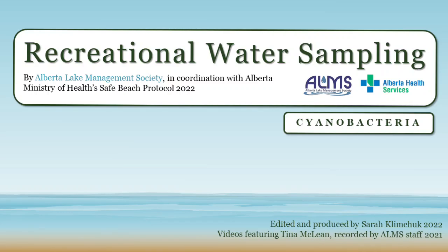In this video, you will learn how to collect water samples to be tested for cyanobacteria. These methods follow Alberta Health Services protocol for water sampling in coordination with the Alberta Safe Beach Protocol, brought to you by Alberta Lake Management Society.